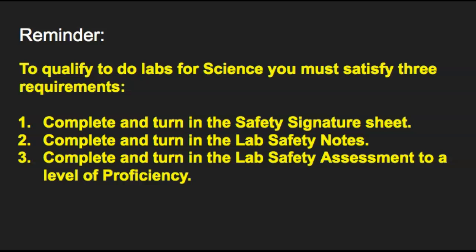Remember: to satisfy the requirements for doing labs there are three things you have to do. One: turn in your completed safety signature sheet — there will be a digital PDF version on Google Classroom. Two: complete and turn in your lab safety notes, which is the student version of this presentation. Three: we will be having the lab safety assessment very soon, and you have to score at a level of proficiency to be eligible to do labs, especially those dealing with fire and chemicals. If you need to retake the assessment you may do so. Thank you, and if you have any questions about lab safety please ask.